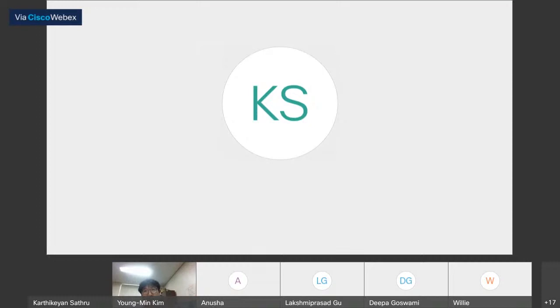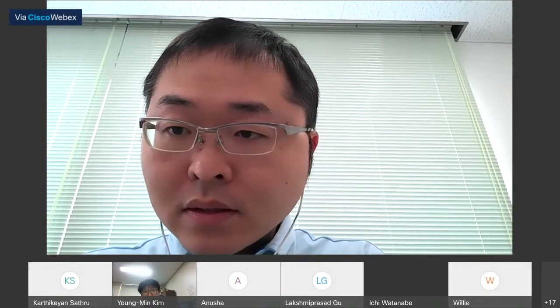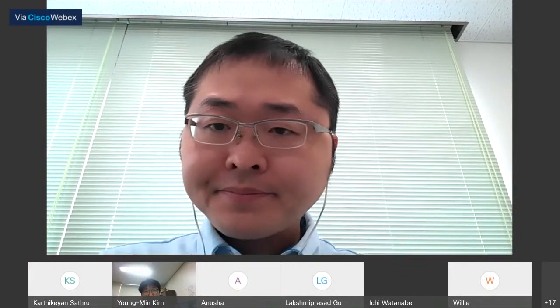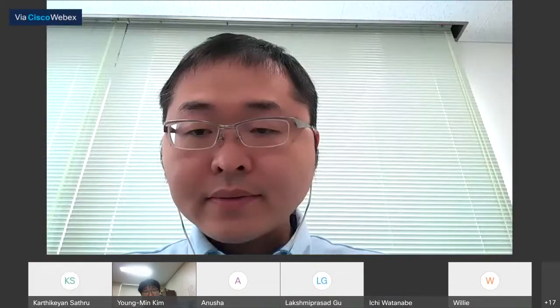Okay, so I will go from the top. The first question, if I remember correctly, is from Dr. Lakshmi. He wanted to know what is the accuracy of the temperature in the catalytic bed. Okay, I think I saw Kim-san type 1 degree. So Ichi-san, do you want to add anything there? Nope. Okay, so I think it's plus or minus 1, is it correct? Yes. Okay, all right, thank you.